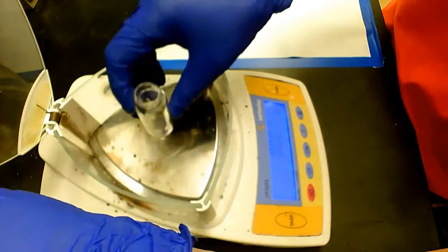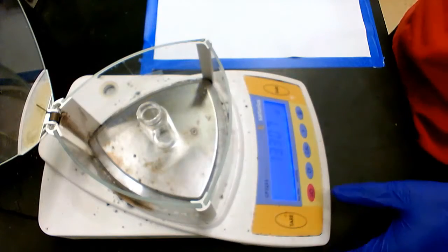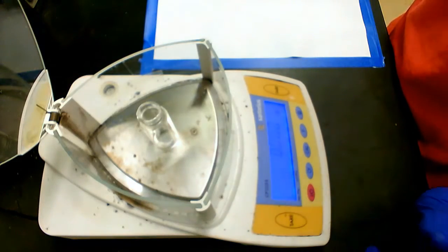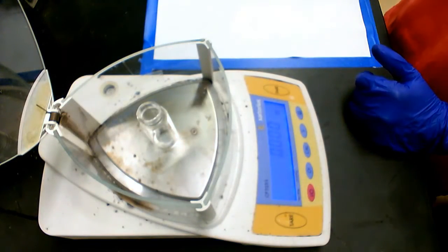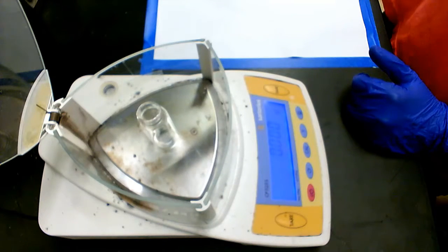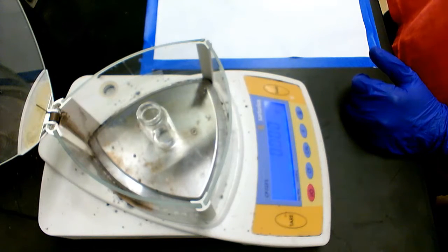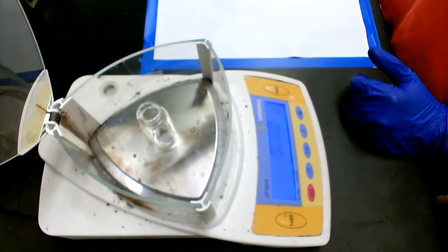First, you're going to put your vial on the balance, tare it, and then get the amount of polymer you need. In this demonstration, I'm going to show you how to prepare a 1% PEO solution in water.